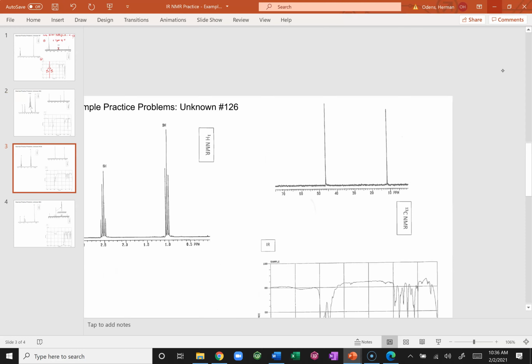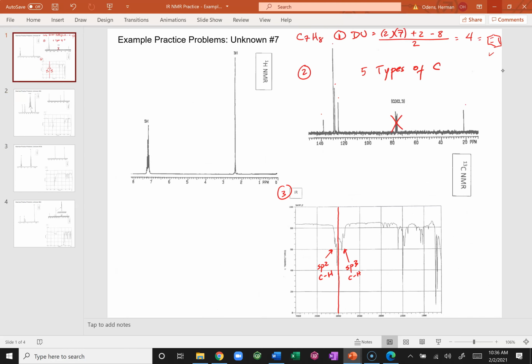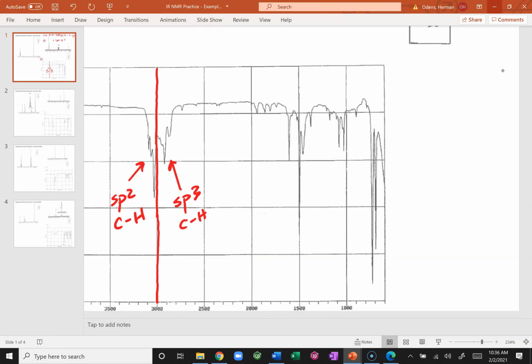Notice that since I have a benzene ring, most likely, which I do, because I have unsaturation of 4. I think I went too fast on that. I'll spot the 1, 2, 3, 4. Those 4 bands, this one, this one, this one, and that one, are between 1630 to 1600 to 1430. Those are my C double bond C stretch. And this one right here, those 2, I usually pick the long one.